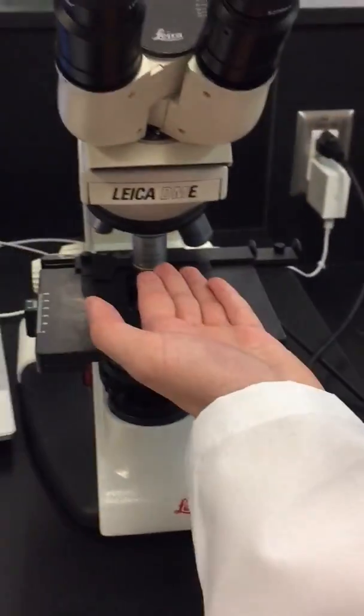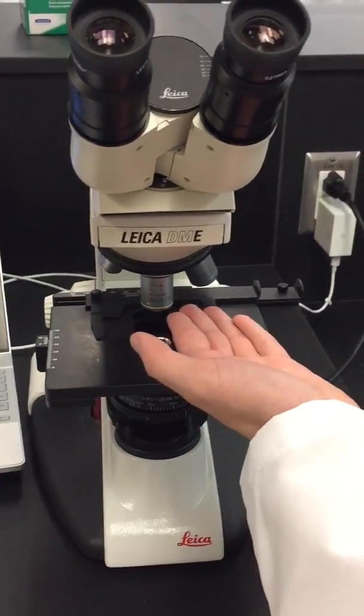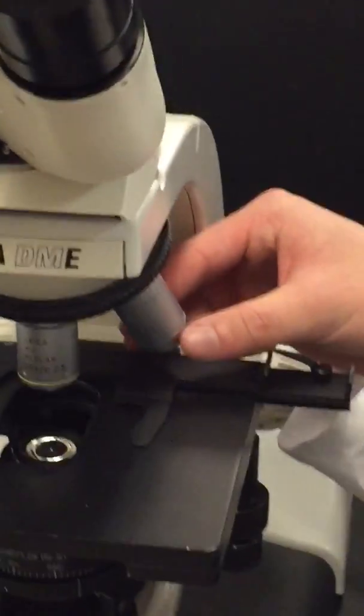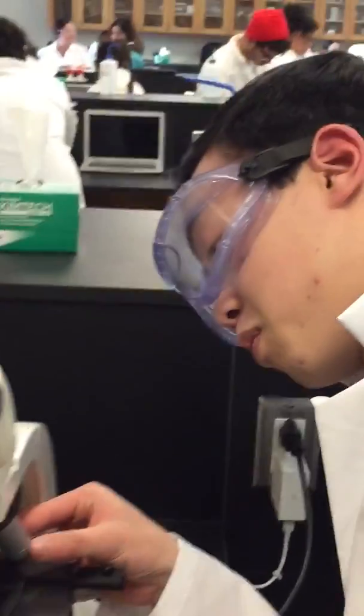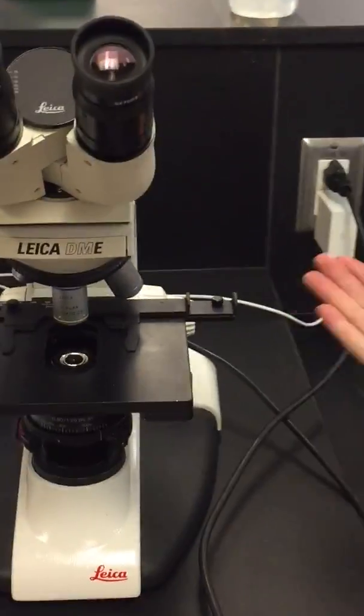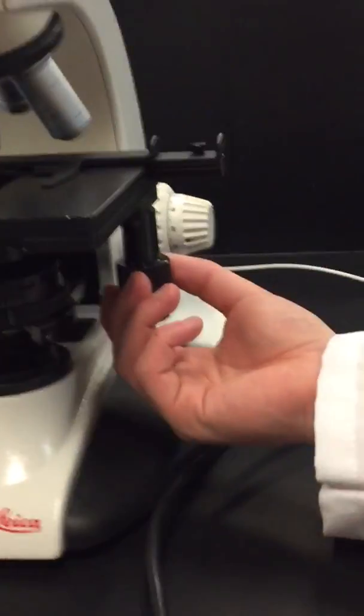The yellow is the second highest which is 10 by 0.25 magnification and this blue one over here is absurdly high, it is a 40 by 0.65 magnification. And lastly, these two knobs here are part of the stage control.